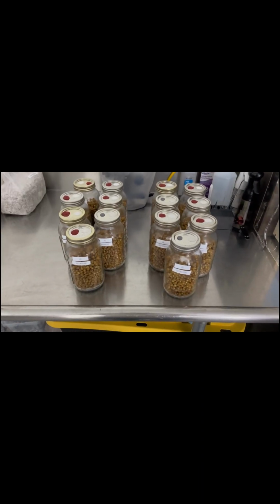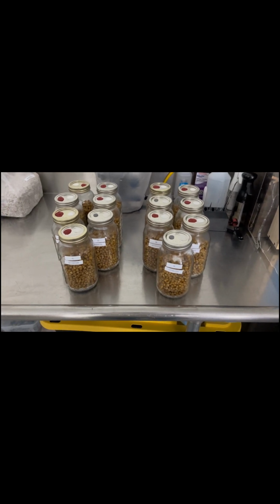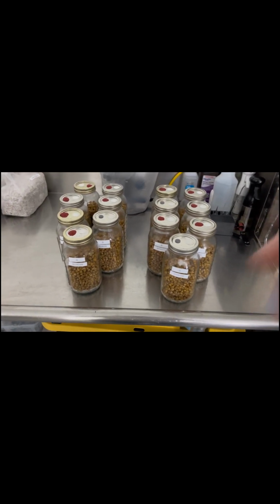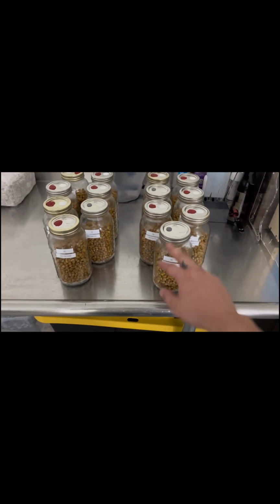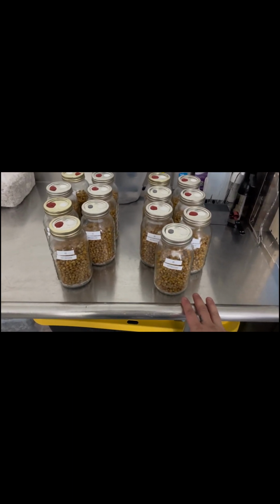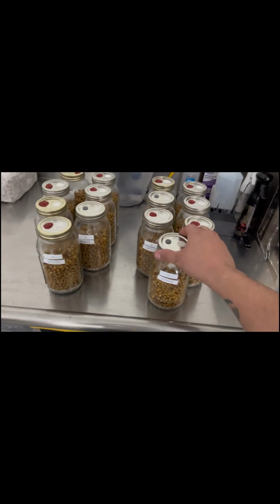All right, guys. The date is September 25th. It has been 7 days since I inoculated these. Here we have the drippy corn. Here we have the regular. And up until about yesterday, they looked like the growth was pretty similar, but now it looks like the drippy corn is actually taking off quite a bit more.